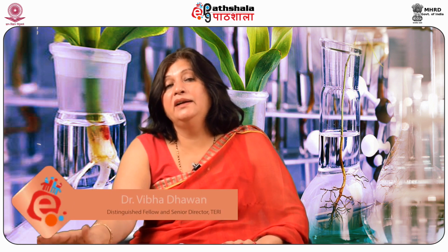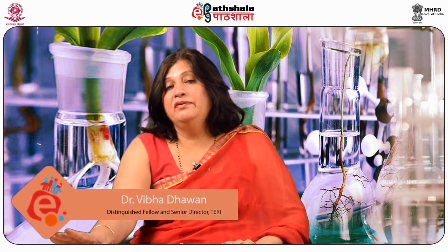So in this module, you have learned how a large number of shoots can be produced by tissue culture technology in culture, and what precautions are to be taken while we multiply shoots so as to ensure that they remain clonally uniform, and we meet the objective of producing mirror images of the mother plant, or true to type plants. The shoots must be prepared so that they can be rooted very well and then taken to the next stage of rooting and transplantation. So I hope you have enjoyed this particular talk and would like to take tissue culture as a career.